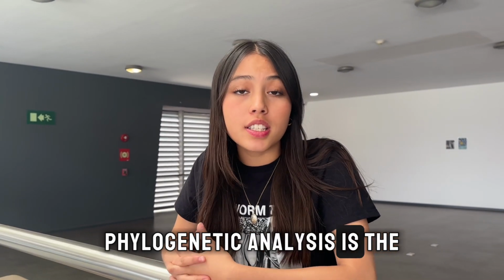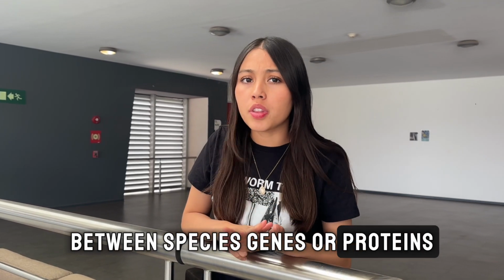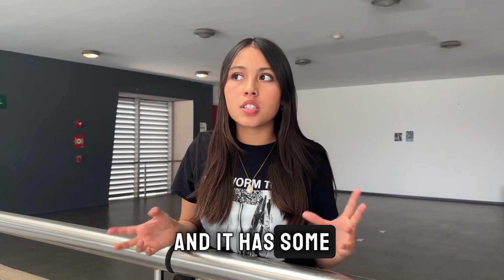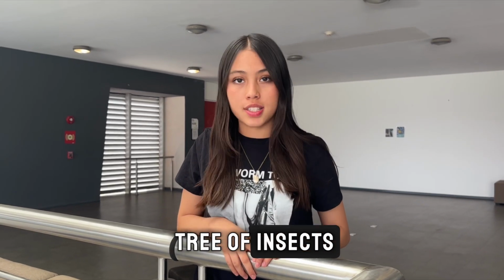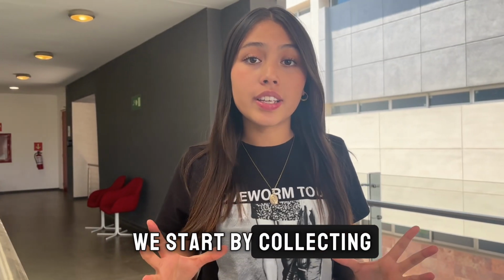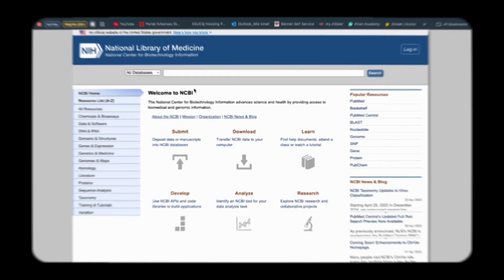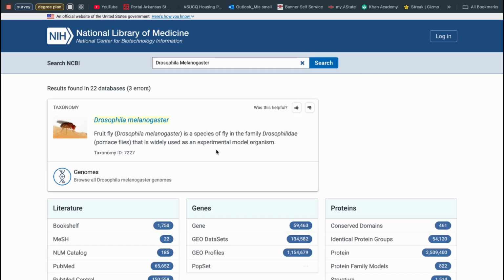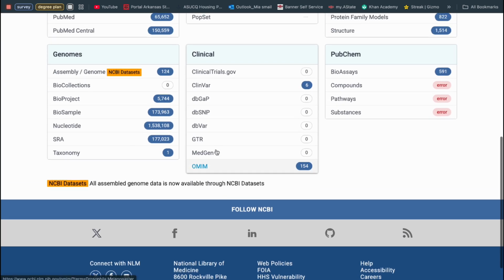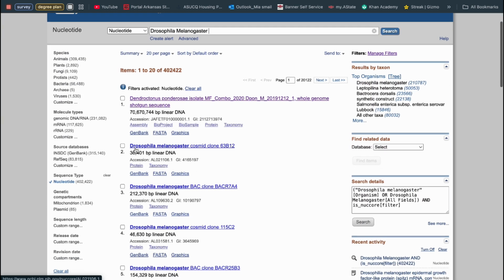Phylogenetic analysis is the study of evolutionary relationships between species, genes, or proteins. And it has some fundamental steps, and we're gonna explain it with a phylogenetic tree of insects. We start by collecting genetic sequences from different species of insects. These sequences are public in databases like the National Library of Medicine. You look for the name of the species, then look for the nucleotide, and then find the sequence to analyze.